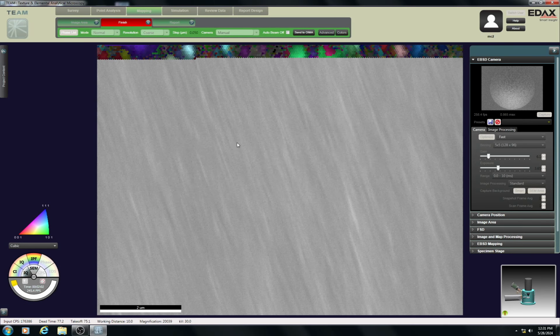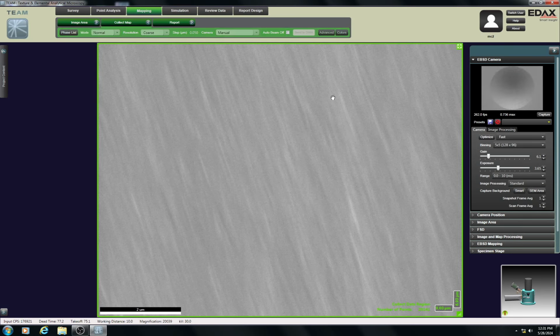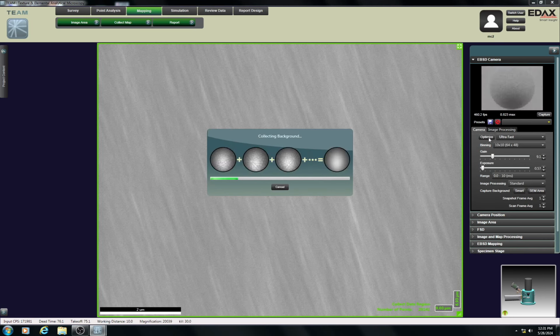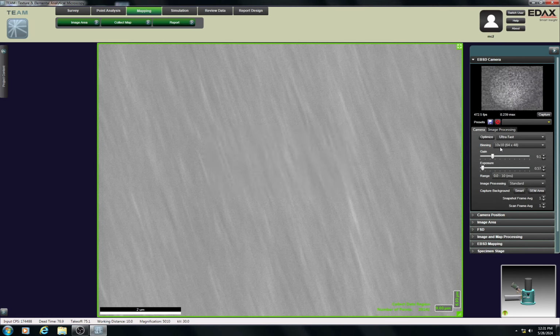So let's stop that. Again, the point of this video is not to watch us collect data, it's how to set it up. Let's try one of the other ones. Let's try ultra fast. Let's see what that does. So we pick the recipe, we click optimize, and so this one is doing the 10x10 binning. So now we're running at the 460 frames a second maximum, and still everything's the same here. It's still doing one frame only.